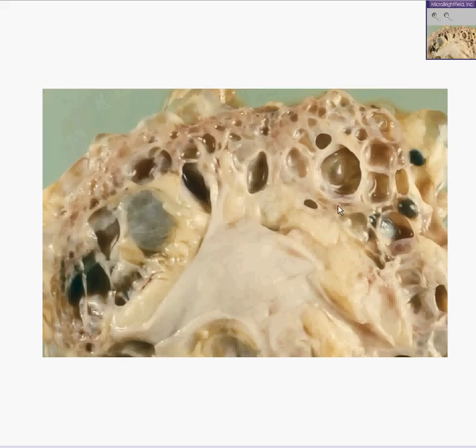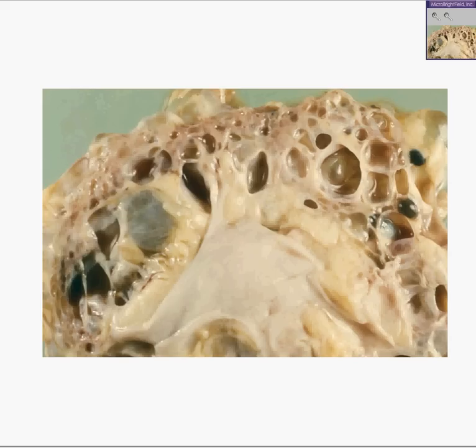If you look carefully between some of these cysts, maybe you could find at least histologically some areas of glomeruli. There would have to be some, at least, if this was presumably a person who lived to adulthood. And as long as we're talking about adults, let's talk about the most common type of genetic disease called adult polycystic disease.